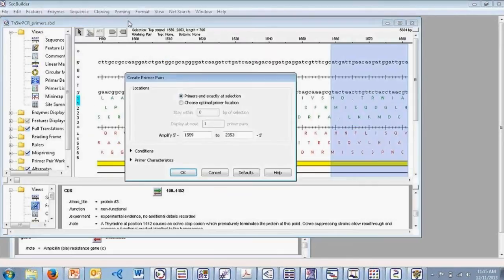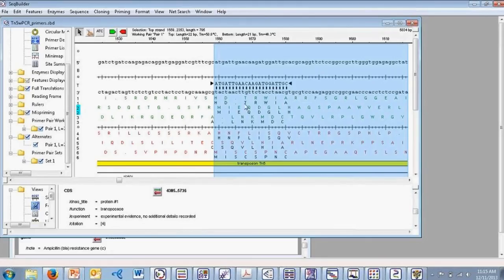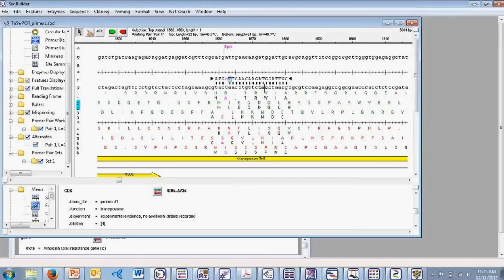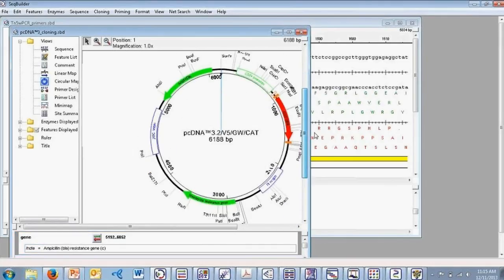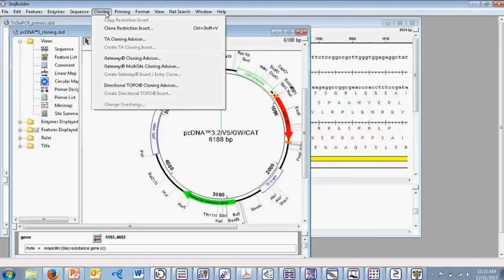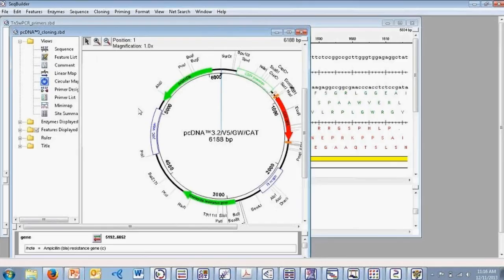We're currently looking at a sequence with features opened in the linear view of SeqBuilder. From this view, we can very easily create PCR primer pairs for a region of interest. I selected a feature of interest, selected Priming, Create Primer Pairs, and clicked OK, and we can see that we've quickly created this set of PCR primers. We can then edit the primer as desired and adjust the ends. SeqBuilder is also great for working on virtual cloning projects — we have gateway cloning, TA cloning, and topo cloning all available within SeqBuilder.